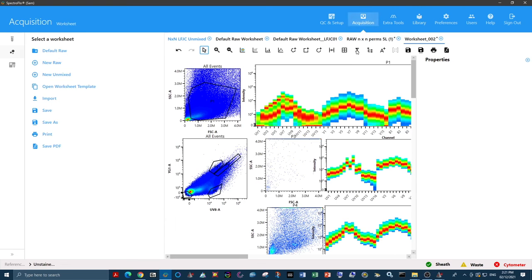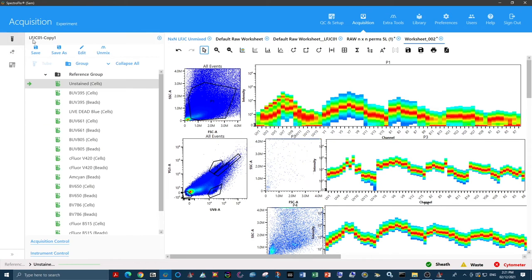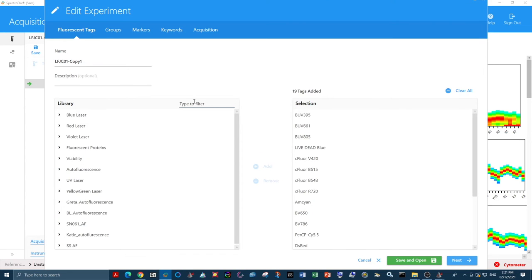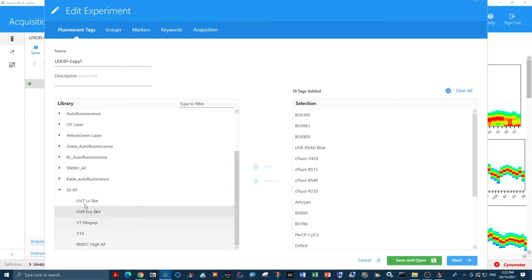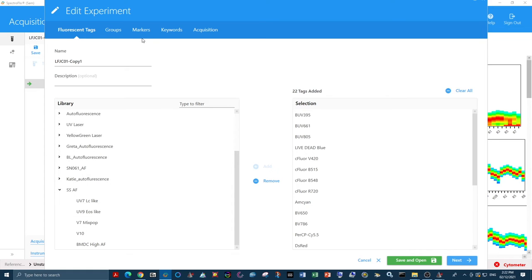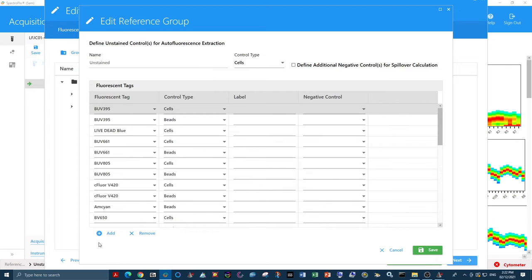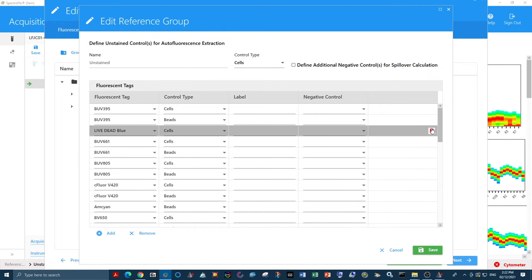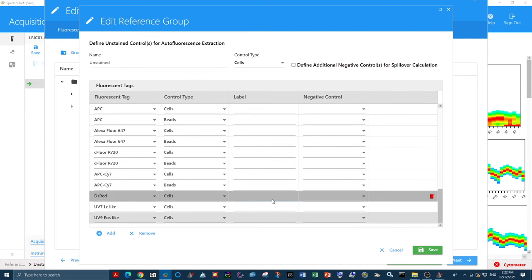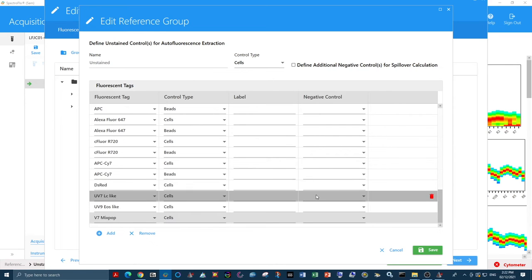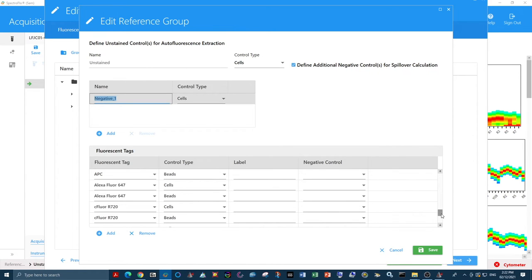If we come back to the experiment, we now have to add these tags that we've just made into our experiment as if they were fluorochromes that we were going to unmix. Now that I've added them to my library, I can find them here under my autofluorescent tags. We just add the three that we created. And of course, we need to add them to our reference group, as we have just made some single-stain controls.